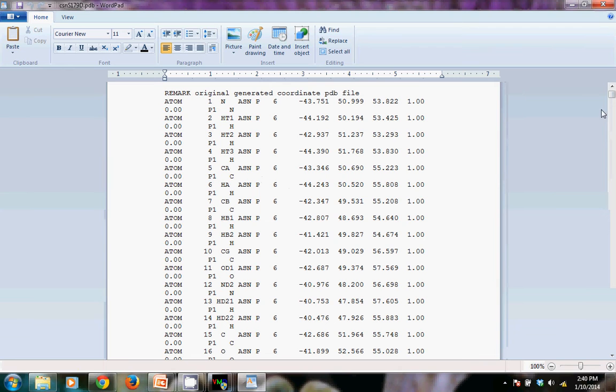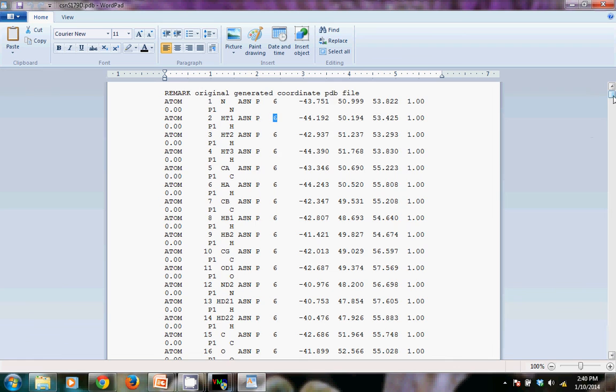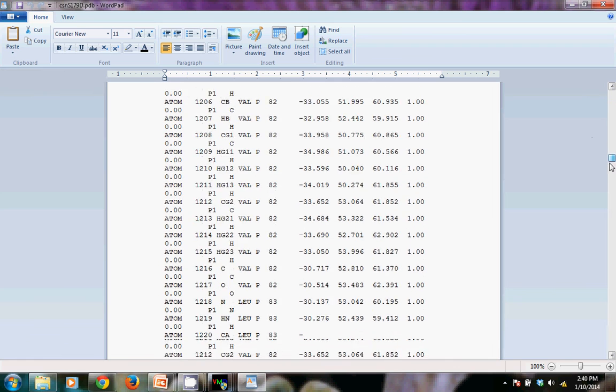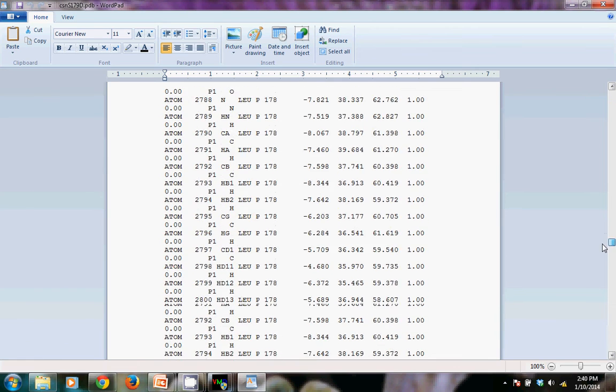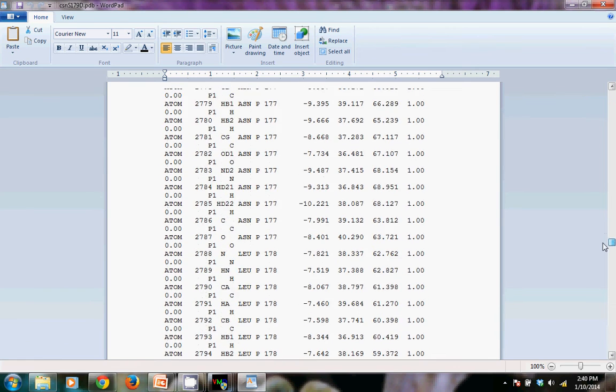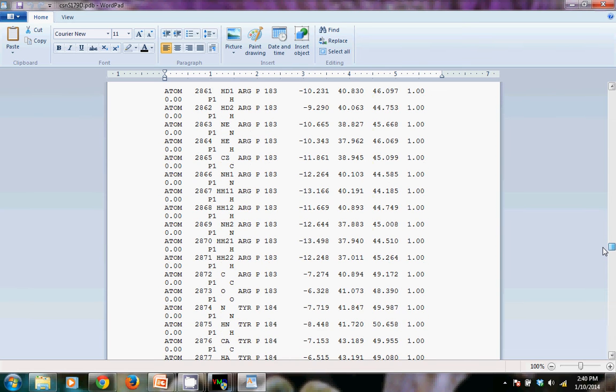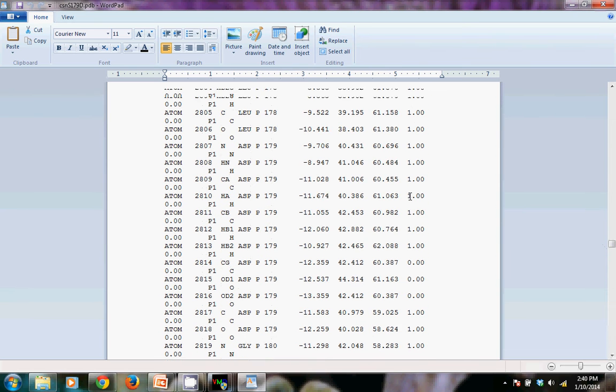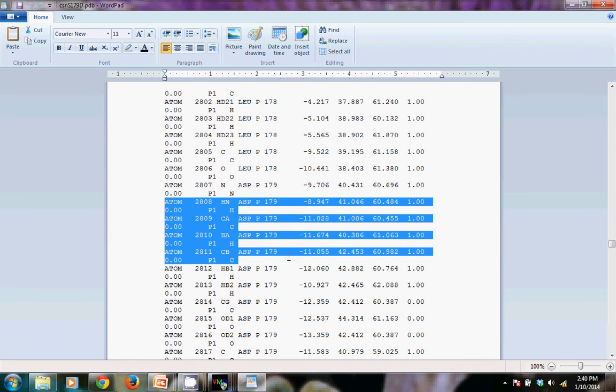And what I want to do, we start with amino acid 6 here, residue 6. I'm going to scroll down to 179. And I see here that it's been mutated to aspartic acid.